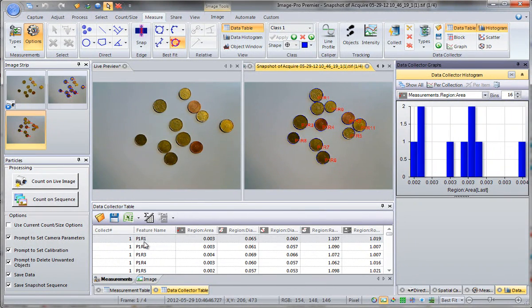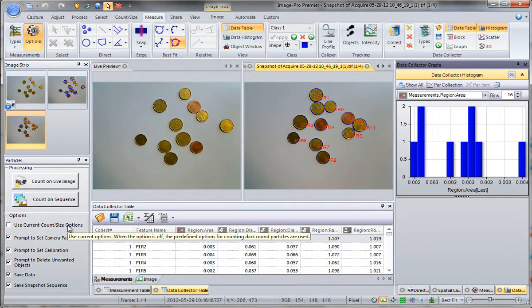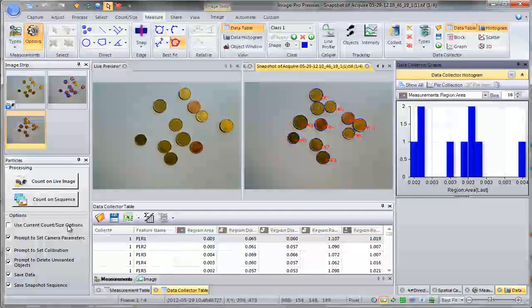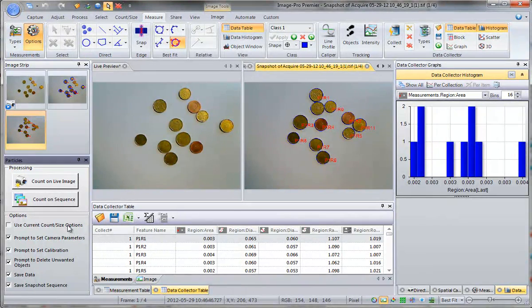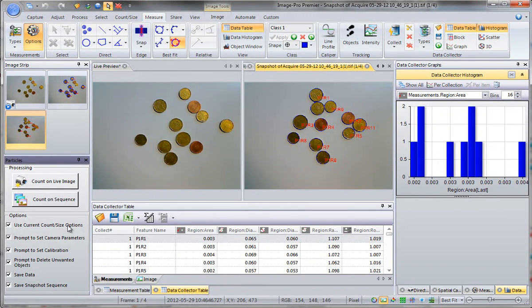Data collector gives you the possibility to see a histogram of the measurements, a data graph, and other parameters. If you want to use your own options — for example, counting dark objects on a bright background or bright objects on a dark background — simply activate this option. Use current count size options and the program will use the options you have set.